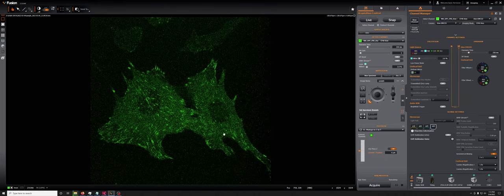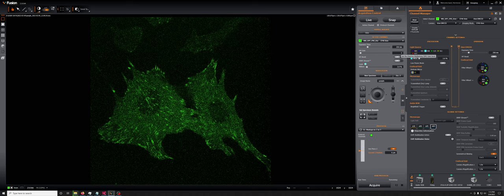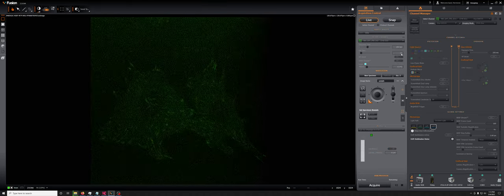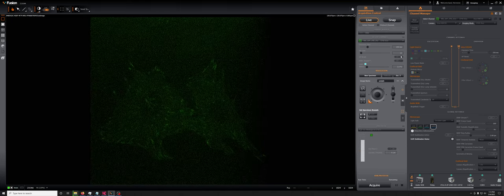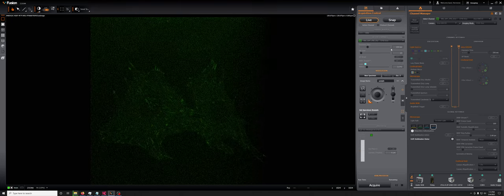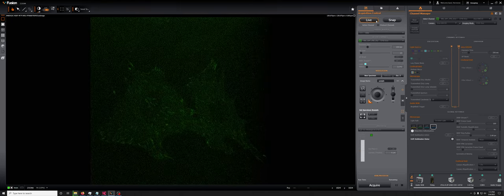So if you're in a situation like this, what you should do is start doubling the EM gain and seeing how the image changed. You can see already going from five to ten, we have a significant improvement.